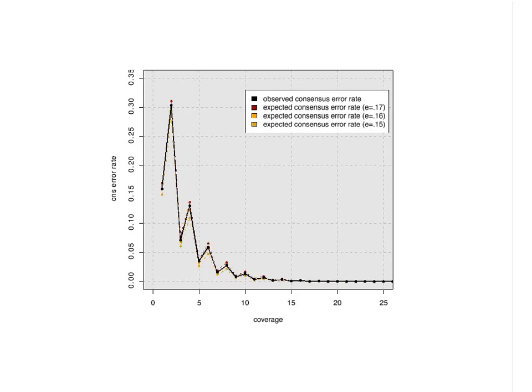Have you tried using the cloud for this at all? Any reason you couldn't? I think PacBio themselves are looking at that. I think they are looking to have their analysis toolkit available on the cloud. And also there is a virtualization project called CloVR, C-L-O-V-R, that was written by friends of ours at the Institute for Genome Sciences at the University of Maryland. They have Celera Assembler included in their virtual machine distribution, and in future versions, I believe they're planning to include our correction pipeline as well.